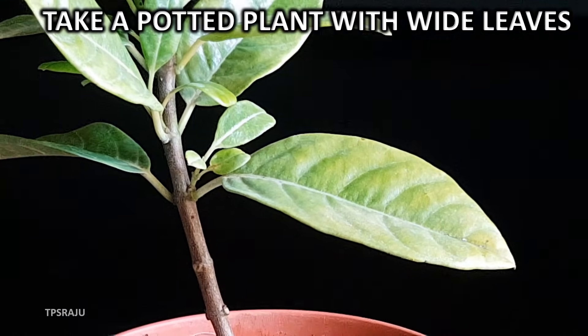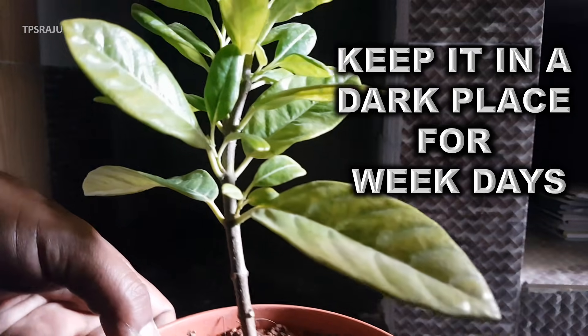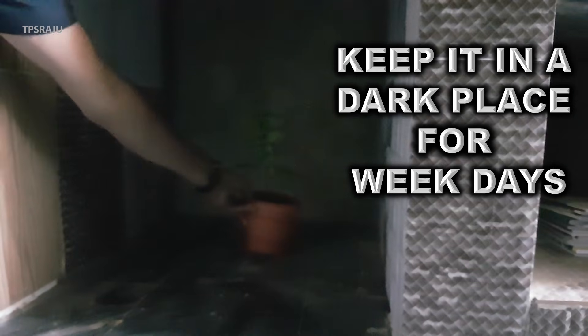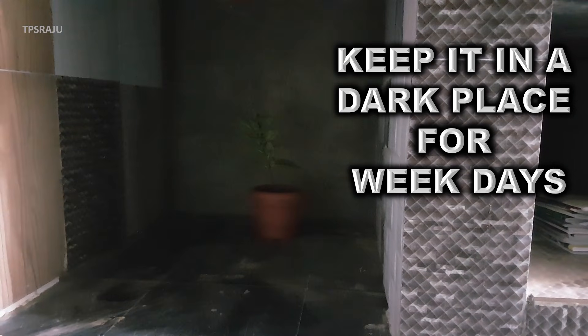Take a potted plant with wide leaves. Keep it in a dark place for a few days. During these days, photosynthesis does not take place in the plant due to unavailability of sunlight, hence the starch which is present in the leaves is consumed by the plant.